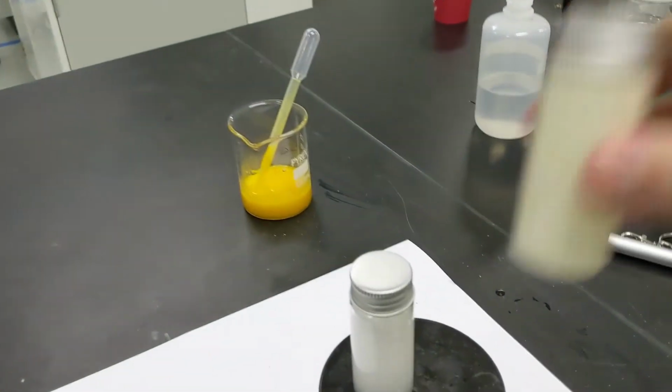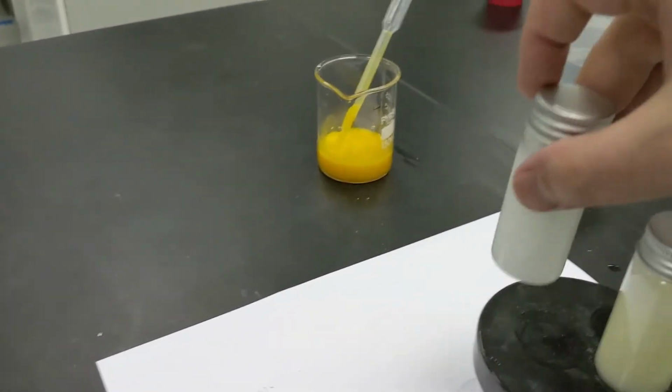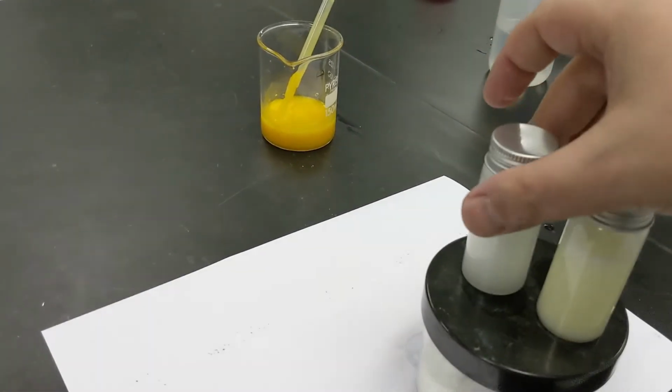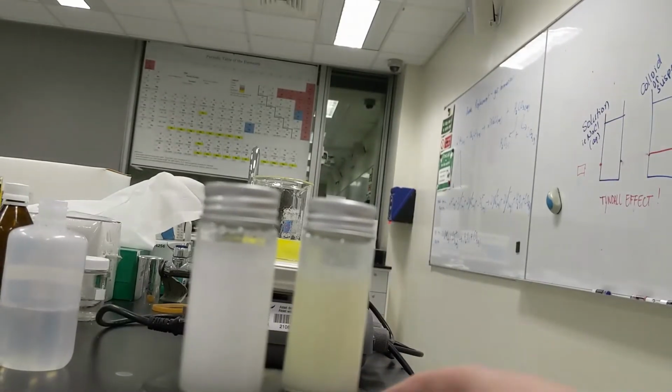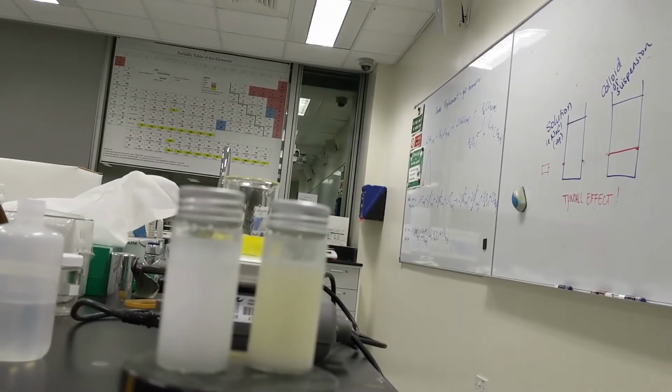I want to see what will happen now with these solutions if I let them sit over time. So I'll do kind of a similar thing here. I'll set up a little time lapse and we'll see what happens with these guys over time.